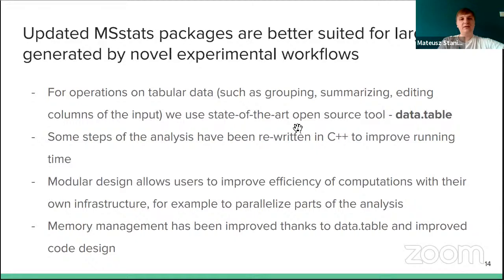So first of all, for all those operations that are purely operations on tabular data, like grouping, summarization, we use the best possible tool in the open source world across different languages, the data table.